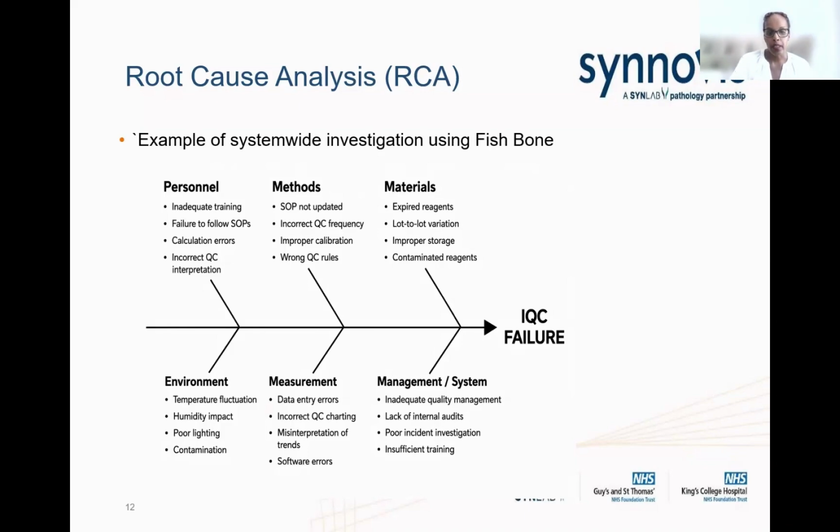And then we have a QMS, so the quality management system in place should also be checking those processes. So you should be auditing the process itself to identify any gaps in all of these areas within your audit schedule. You should also have investigation.